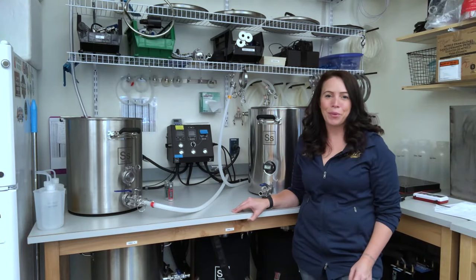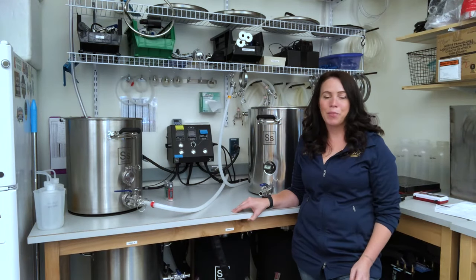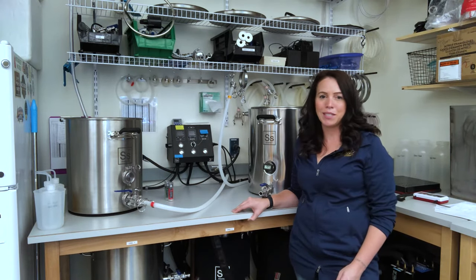Hey guys, welcome to the Barley Malt and Brewing Quality Lab. I'm Hannah Turner, Director of the Lab here at Montana State University. We're super excited you're joining us for Craft Malt Week and to tell you about our breeding program, as well as do a tour through the lab and look at some of the projects that have us busy this fall.